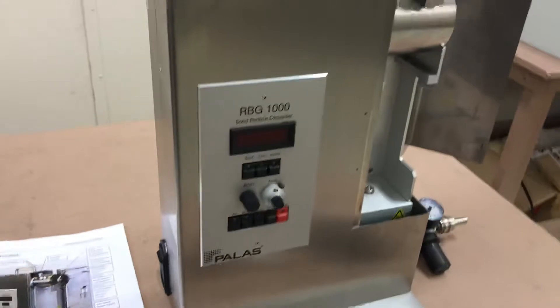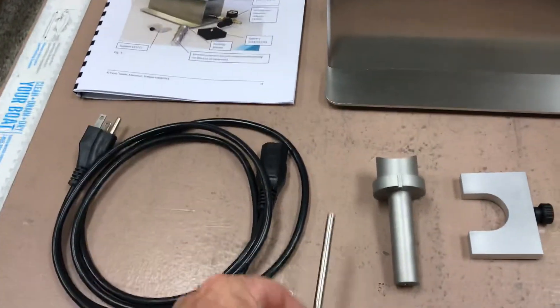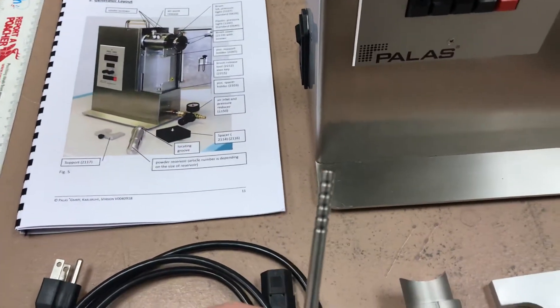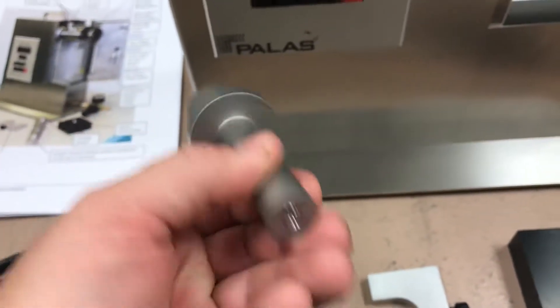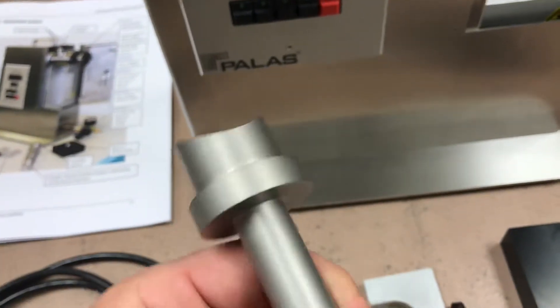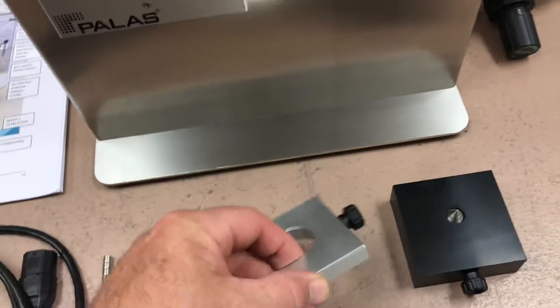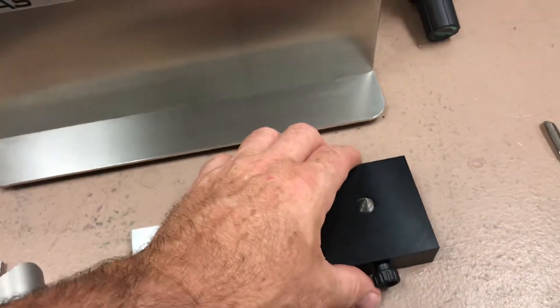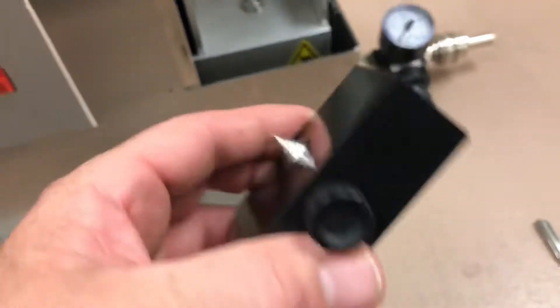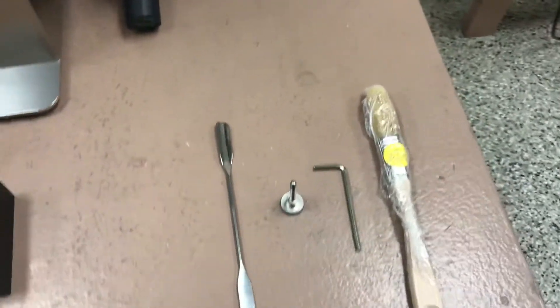Back around the front again. Some of the accessories that come with this unit: this is the brush release tool. Over here we have the powder reservoir — there's the end-to-end powder reservoir, and that mounts up into the unit right there. Right here we have the support bracket for the powder reservoir, which simply goes up into here. Over here we have a spacer at the bottom of the unit. And a few accessories: an allen key and a brush cleaning tool.